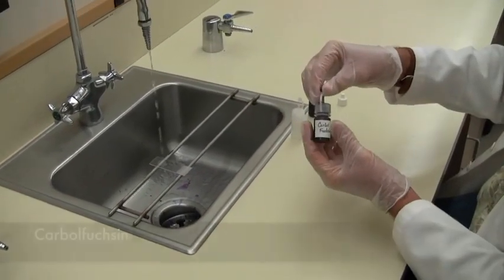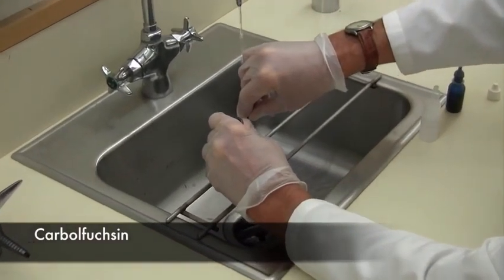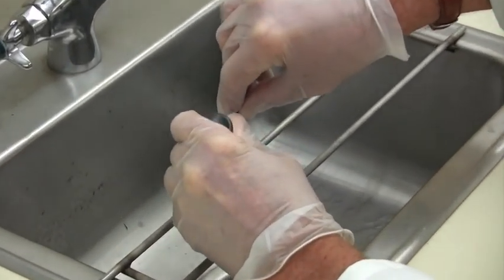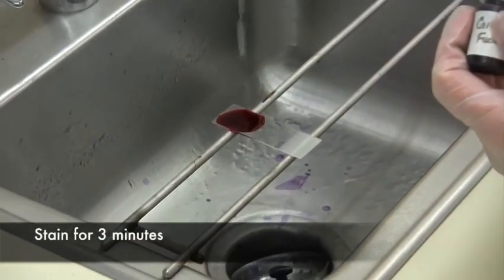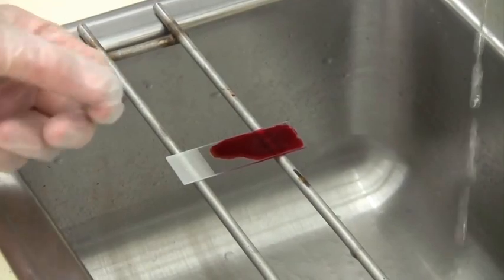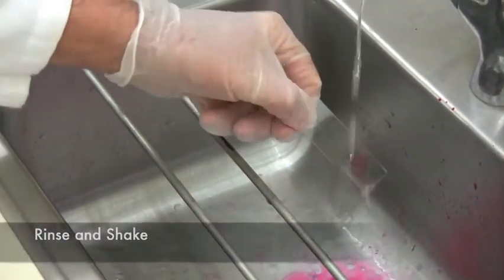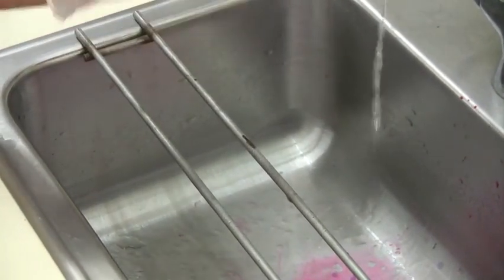We start off with carbolfuchsin. Just cover the smear with however many drops it takes to cover that smear. Leave it on there for 3 minutes. After 3 minutes, you want to rinse the carbolfuchsin off the slide and shake off the excess.